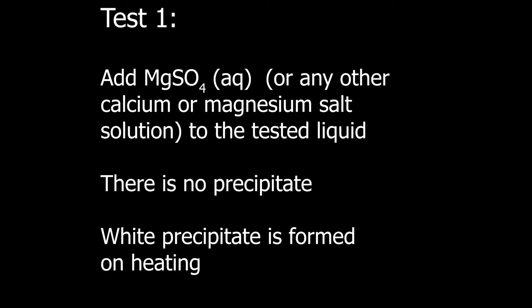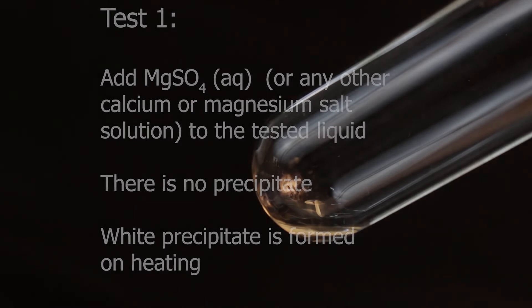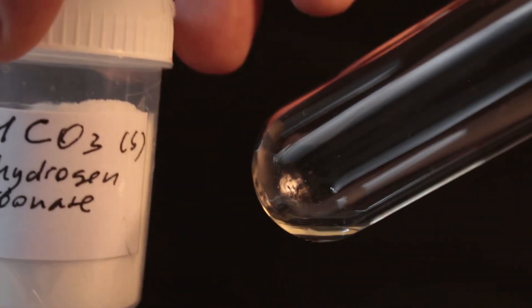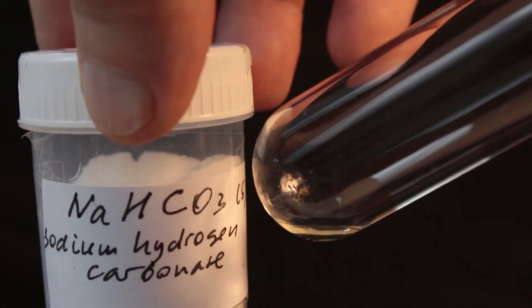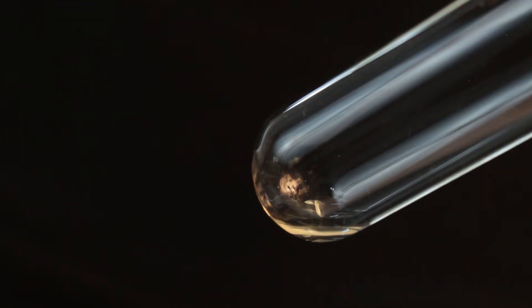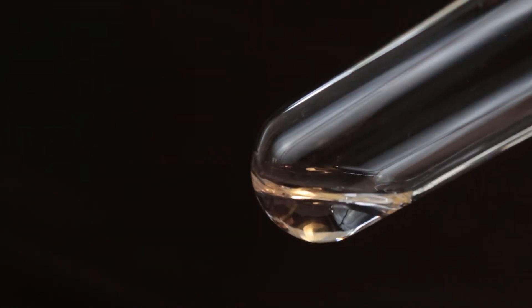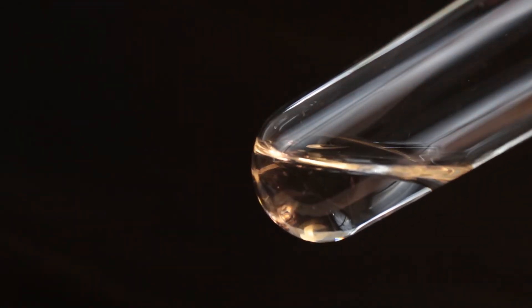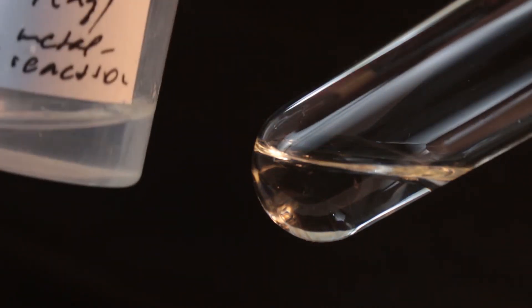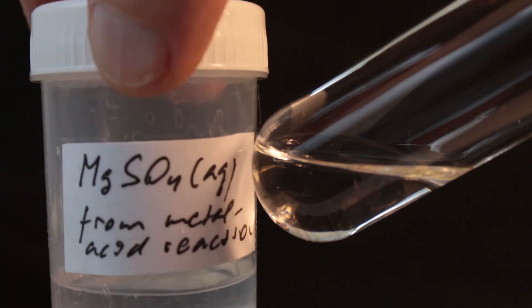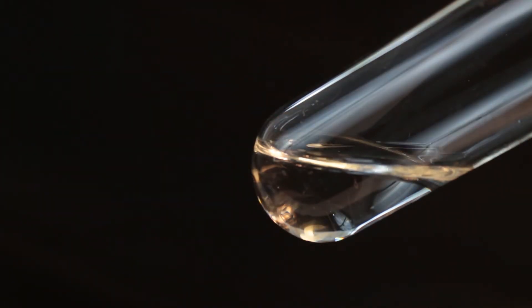First we add magnesium sulfate to the tested solution, which should remain clear. Though white precipitate should appear on heating. Here for the positive result we use sodium hydrogen carbonate. Adding few drops of magnesium sulfate. Color shouldn't change, no precipitate should appear. This is the part of the test.